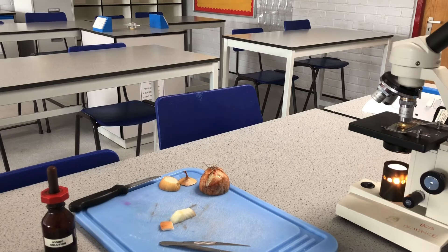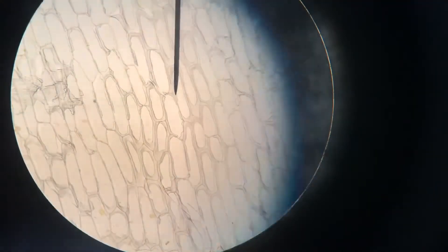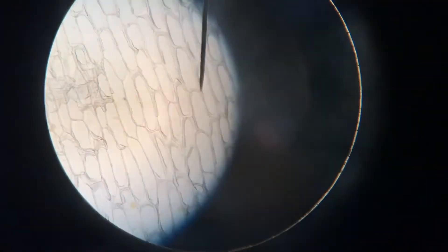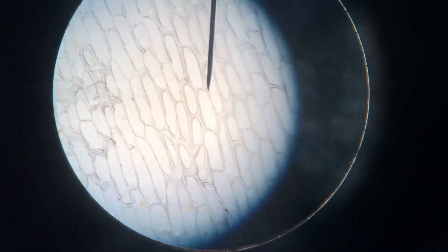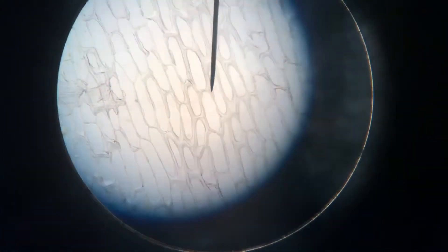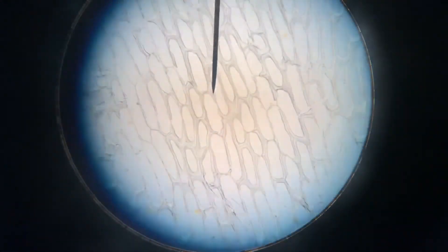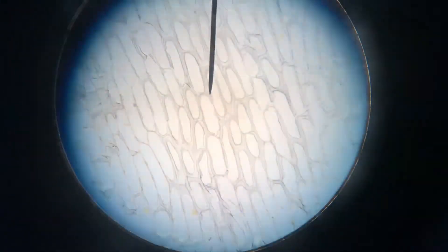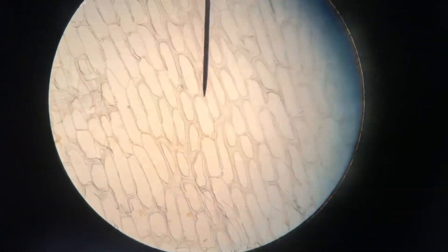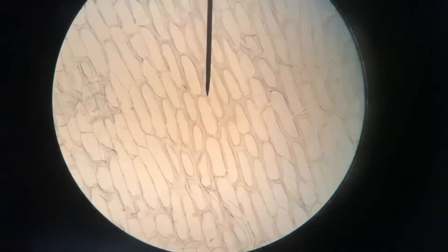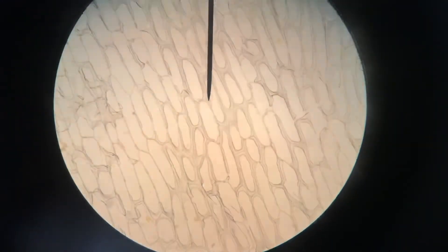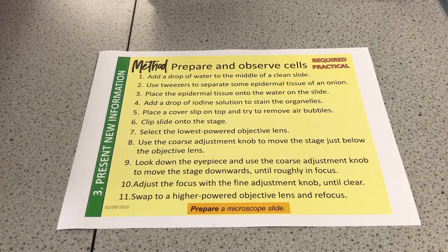That is brilliant — I've got a really good image of the onion skin cells. I've put my phone down the eyepiece lens, so this is actually what I'm seeing in the microscope. You can see the iodine solution has stained the cells — they're kind of like bricks but not exactly the same. We can even see some of the nuclei: one nucleus per cell, and each of those is one cell.